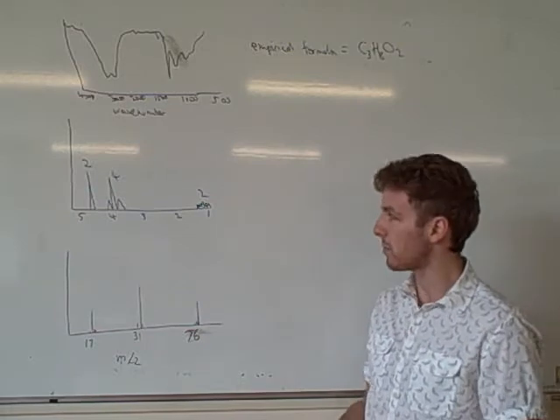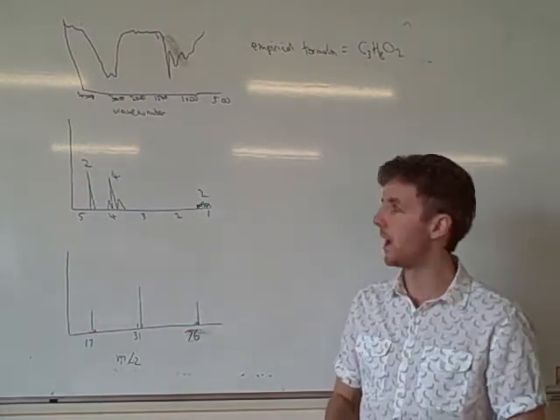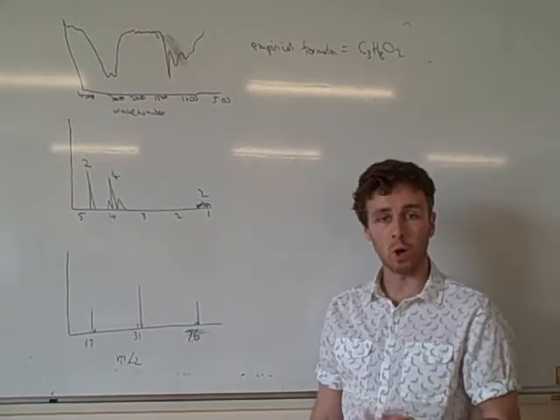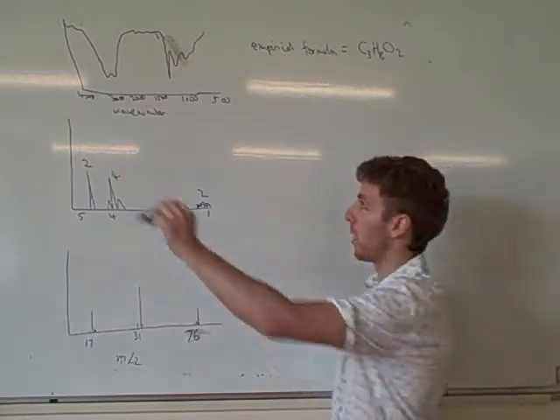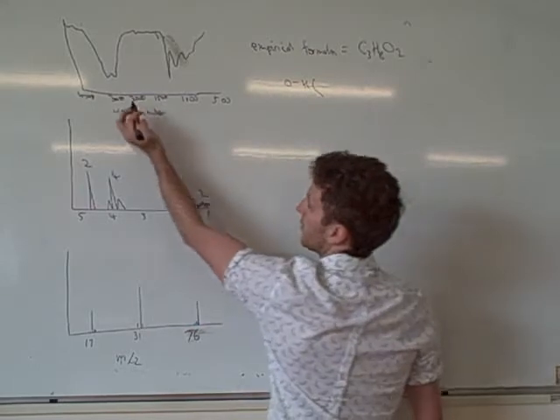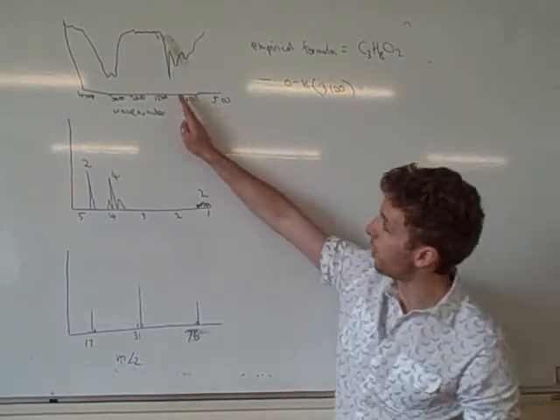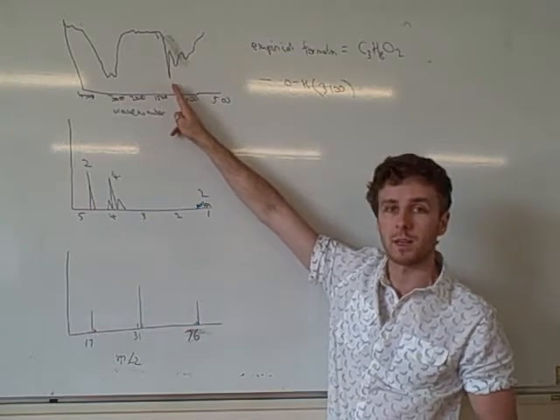So it doesn't matter too much which way you start, you can do it in kind of any order, but I think this is a good way to do it. I always start off with my IR data and we use that to figure out which bonds your molecule has and from that the functional group. So let's have a look what we've got. We have an OH bond and that's round about 3,100. That's our first mark.